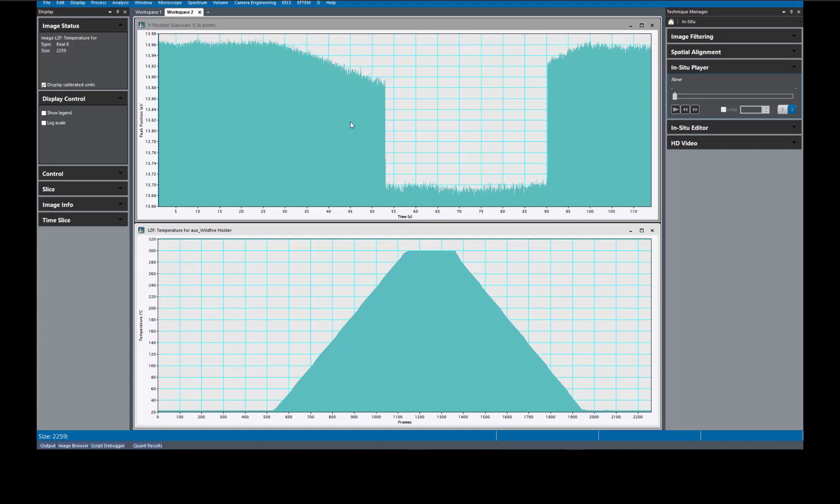In this video, I'm going to show you how you can create a scatter plot from two individual plots in Digital Micrograph.